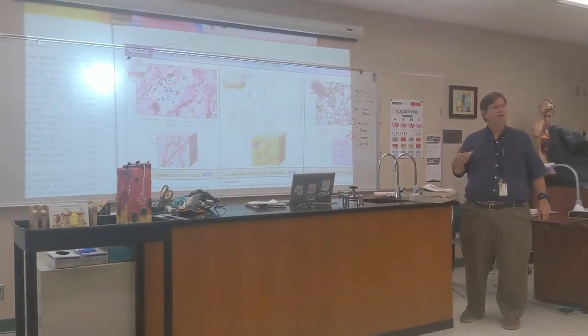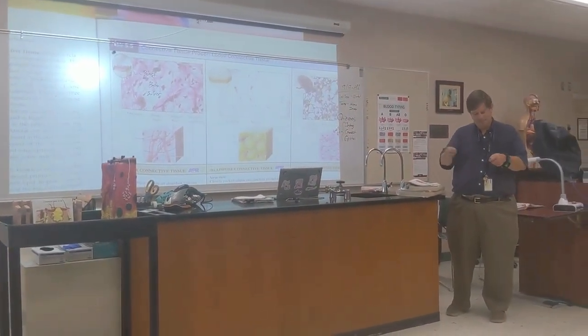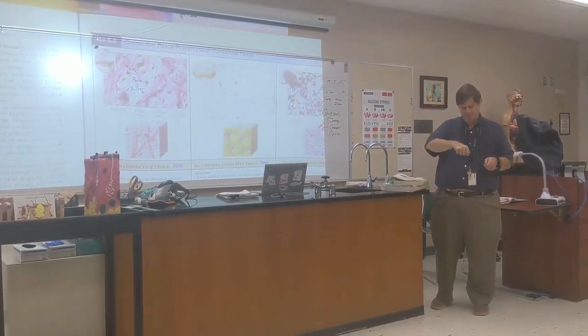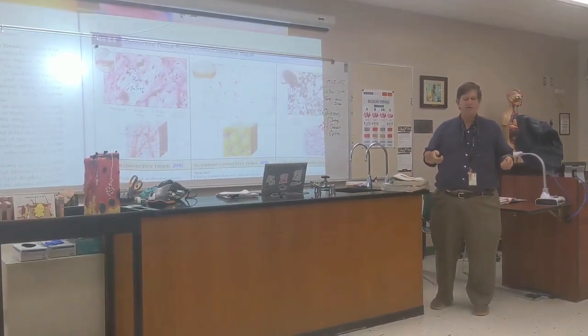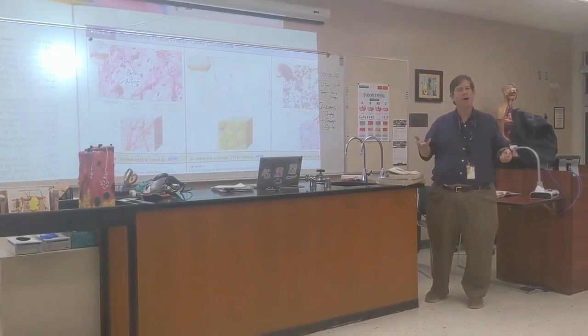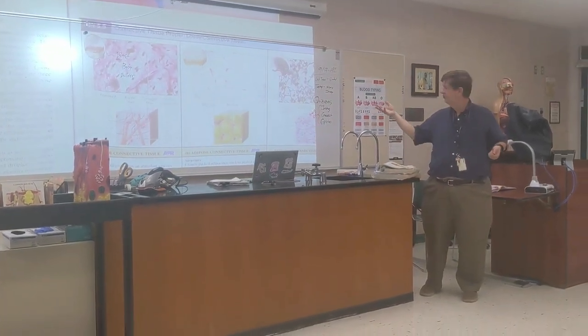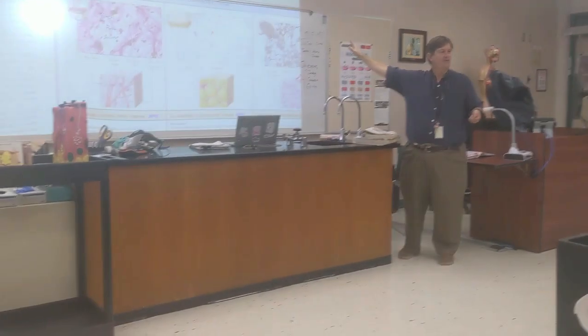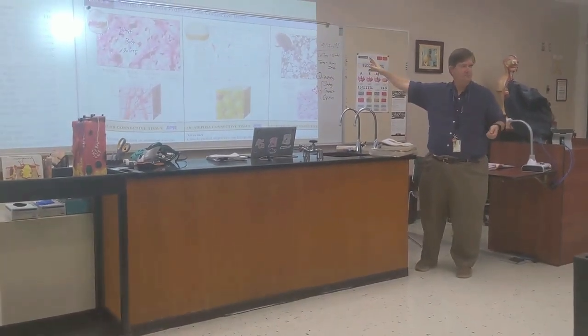So since they're dissolved in water, if you cut a piece of tissue and you put it on a microscope slide and some of it's fatty, and then you put the stain on it, you rinse off, none of it stuck. None of the stain stuck because it was dissolved in water, and water doesn't like fat. So it looks white on the slide. It's not that there's nothing there, it's full of fat. Does that make sense? Okay?